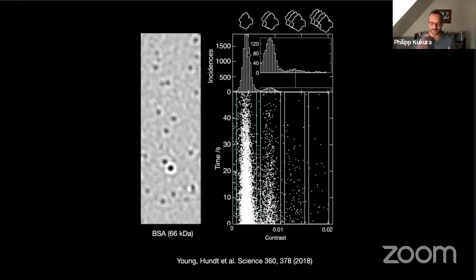And you have to think slightly differently, but ion mobility is something you could implement here in a slightly different way. It's just not ion mobility, it's diffusion. So there's lots of games you could play in order to try and take advantage of some of the things that people are doing in mass spec. But at least from my experience, this has never been a problem.